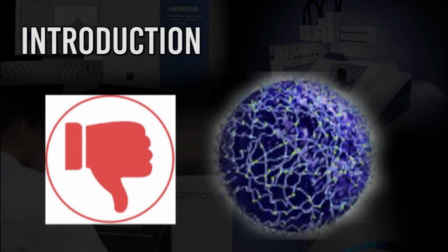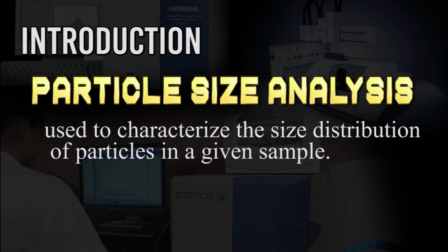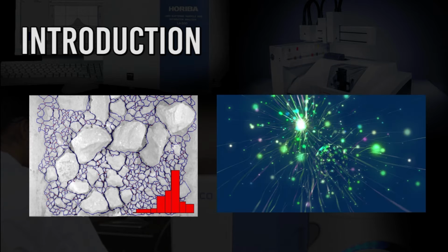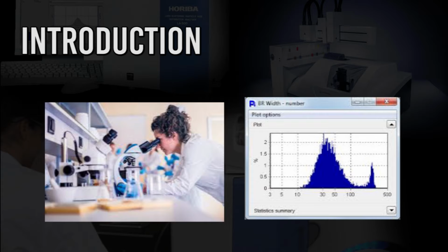to measure particle size. This particle size examination is used to characterize the size distribution of particles in a given sample, which is applied to solid materials like suspensions. There are many different methods employed to measure particle size. Some particle sizing methods can be used for a wide range of samples, but some can only be used for specific applications. One basic problem in particle size analysis is characterizing particles using just one number.